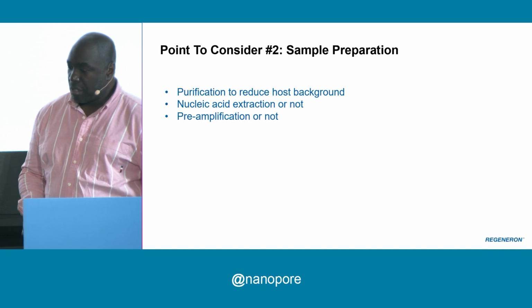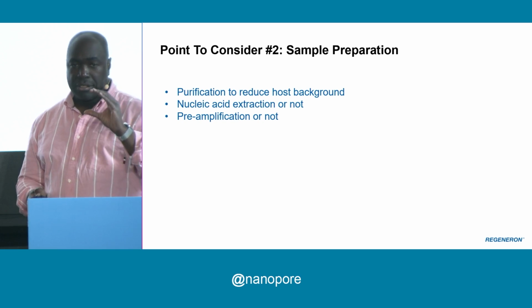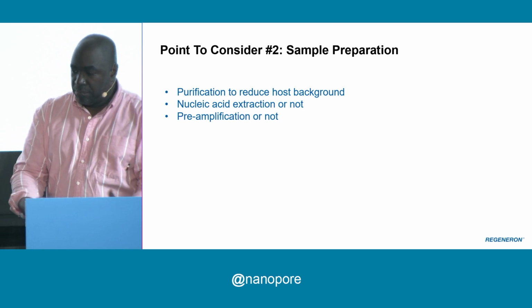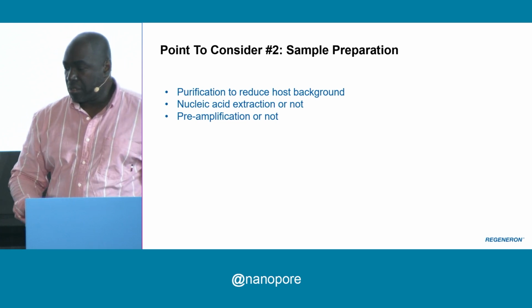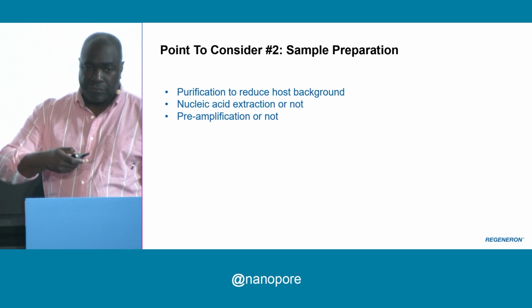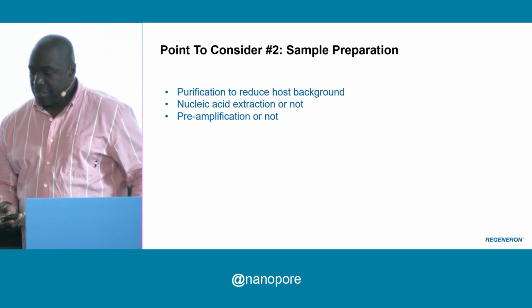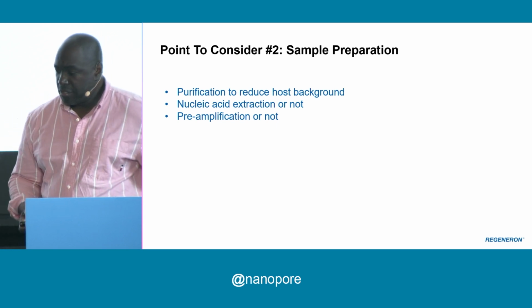The sample preparation is something that we have to work on depending on the sample type that we're having. Here, we just went with a proof of concept with virus put together into a buffer. So that's not really representative of other samples that we might be testing. So there will be a sample preparation that we develop in-house that will be applicable to cell culture fluid and other types of sample. This is meant to reduce the background so that testing can go with higher sensitivity.